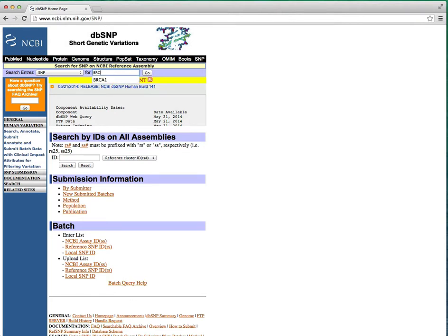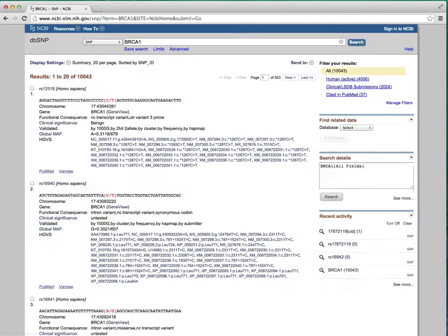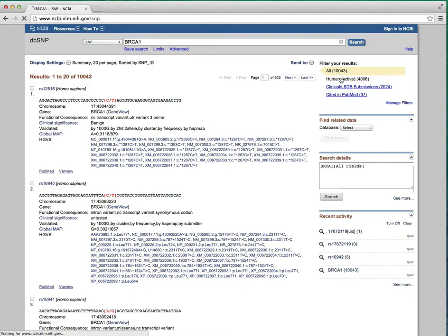Type in a gene name initially to get a list of variants. Notice that SNPs are returned for all species, so you can filter your results to just human entries.